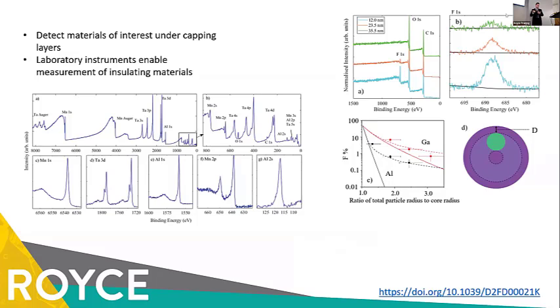This is actually a really fast measurement. We've talked about accumulation times, but we actually measured maybe, I would say, dozens of these samples because they were tuning their deposition system. They wanted to get the aluminium to manganese ratio. We were able to check the quantification. We did some checks that our quantification was working, and then we were measuring one sample, just a couple of core levels every 10 minutes, and it was actually quite a fast high throughput measurement.